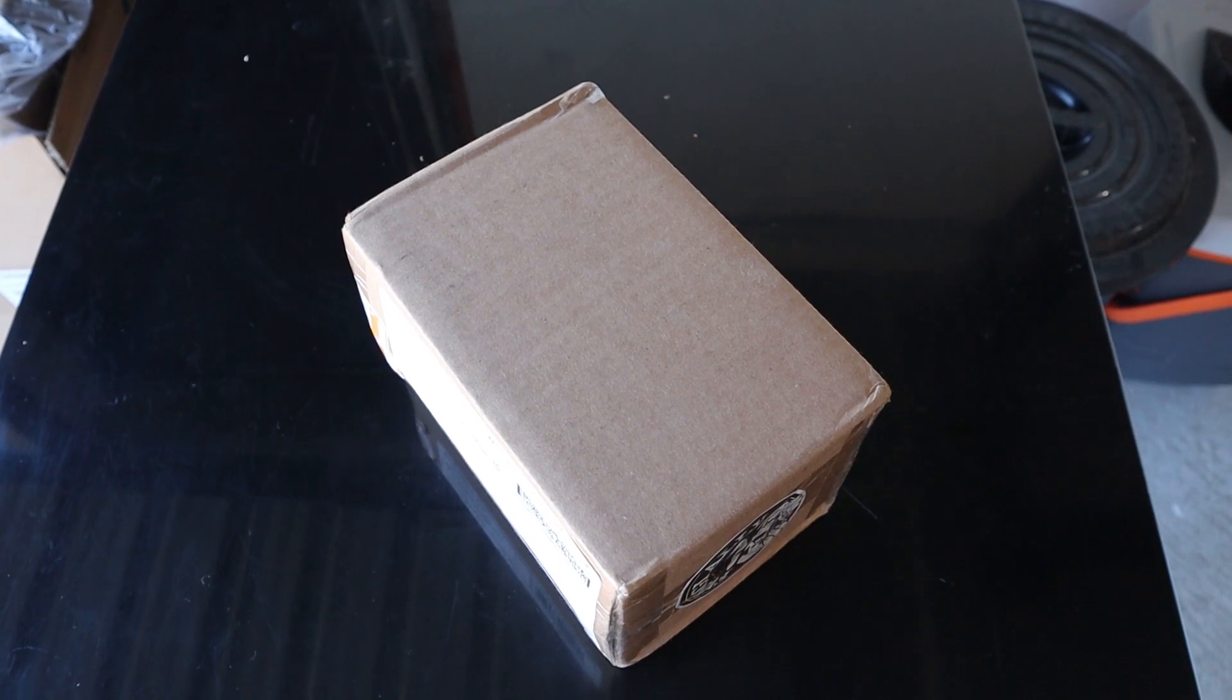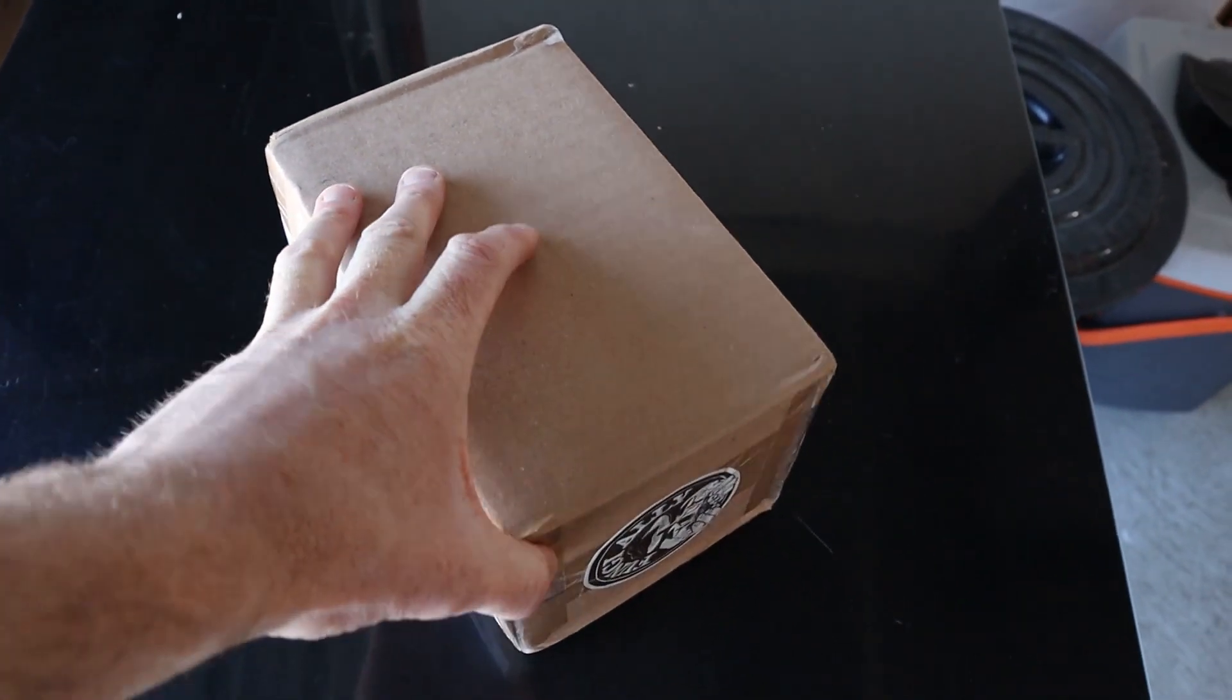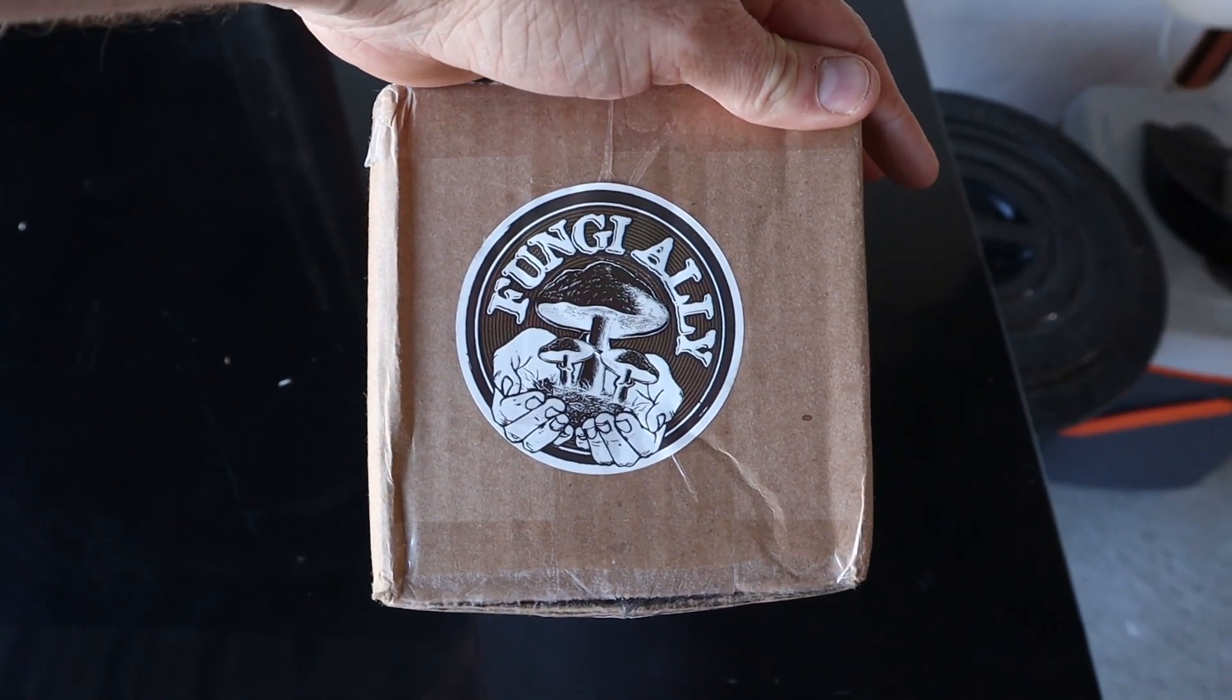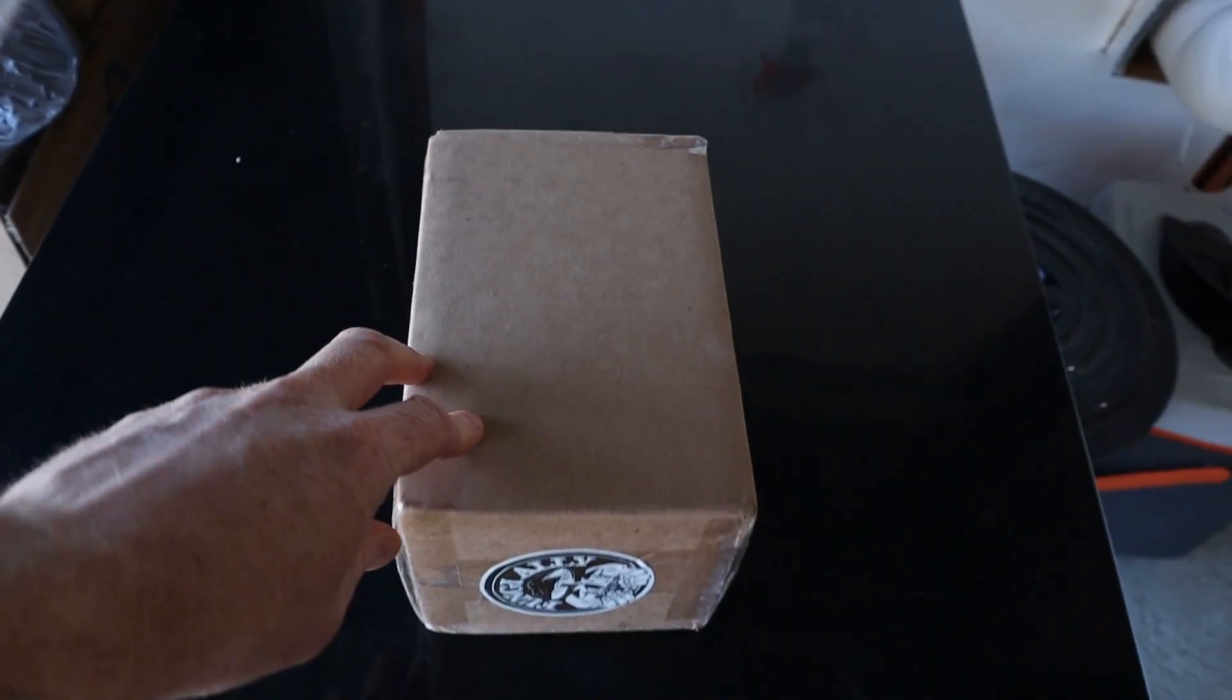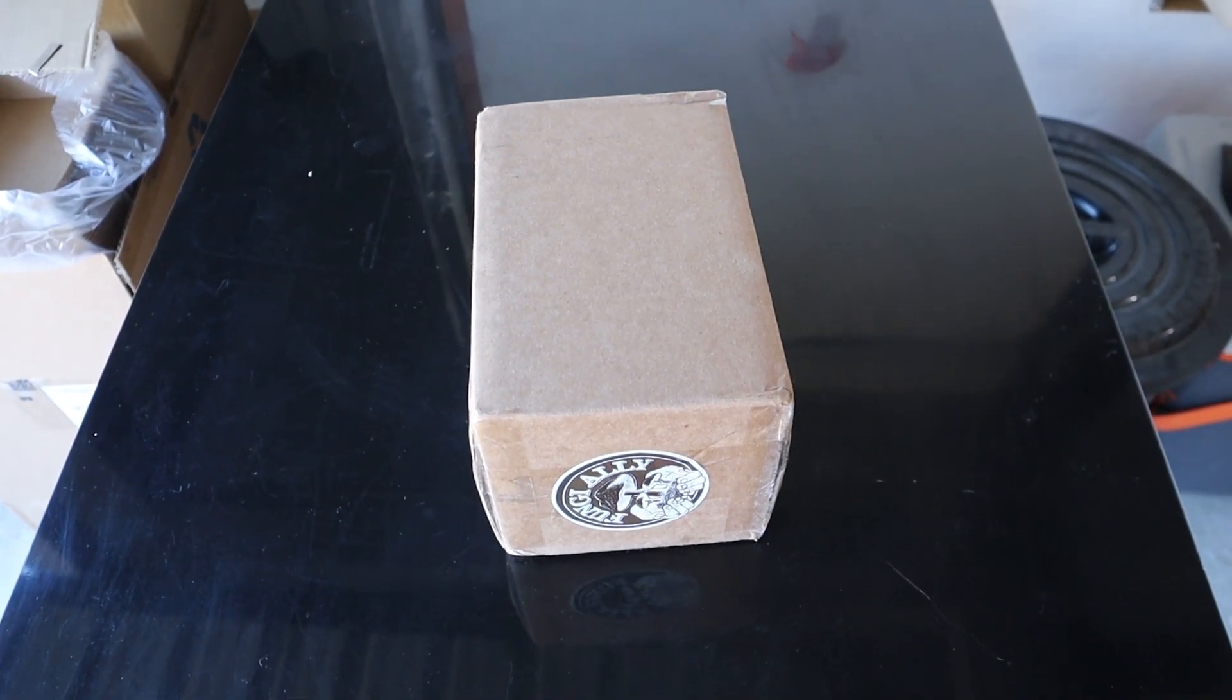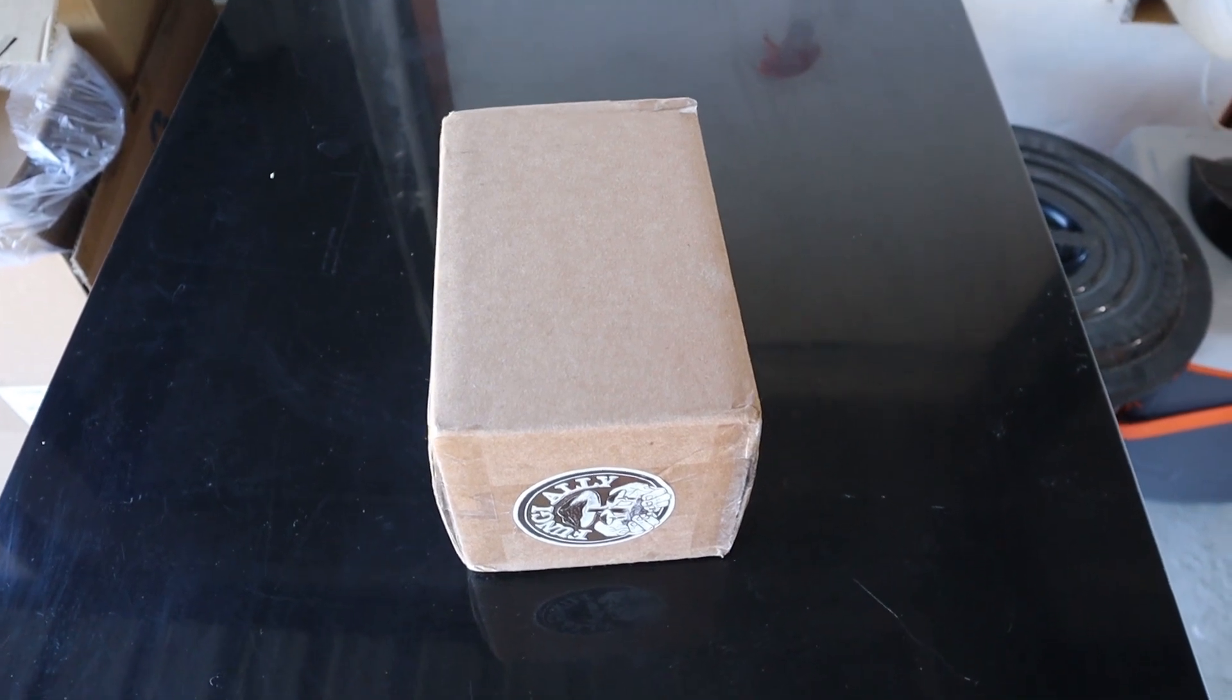I'll give you guys a quick guess at what this is. If we look on the side you'll see who it's from. Boom, there is shiitake 3790, and this is the first time I believe I've seen it in New Zealand. I'm not sure if any other commercial growers use it, but I've never seen it for sale here, so finally it's here and I can grow it.